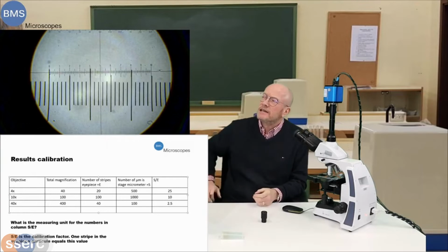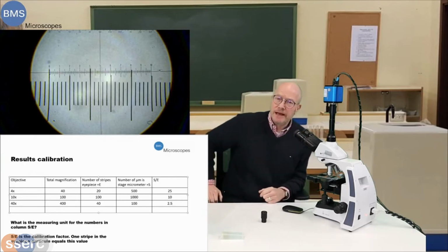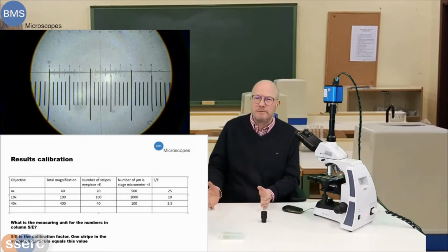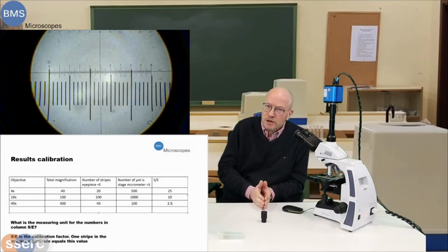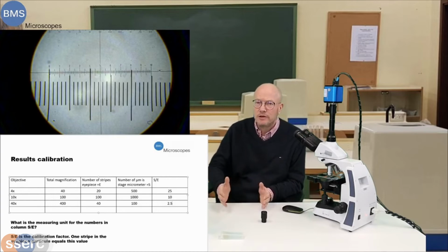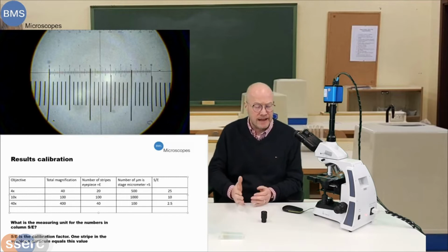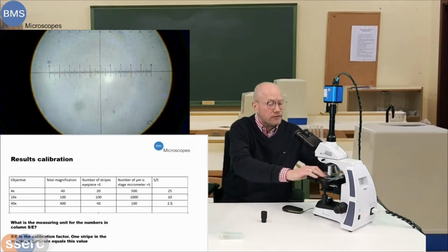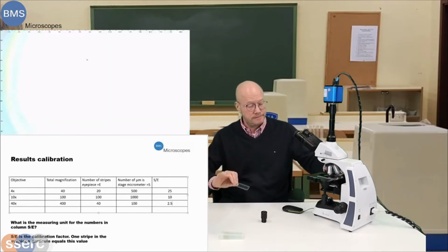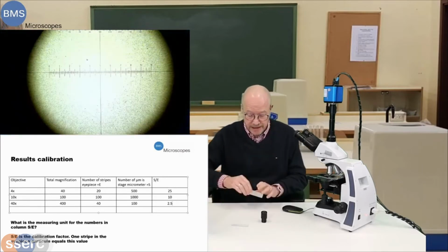By rights, can you give a unit to it? By rights, yes, it's the micrometer, but on the other hand, it's the factor that you need to have your measurements done with the several objectives later on in a real slide. And we're going to do that right now. We're going to move the stage micrometer. You can lose it now. We can have a proper slide.